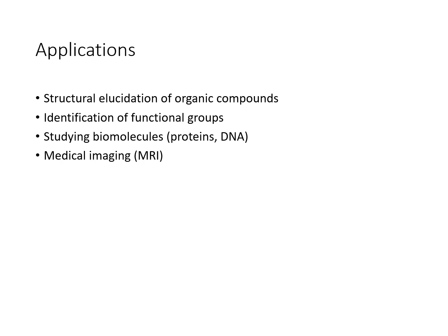NMR is essential for determining the structure of organic molecules. It is used to identify functional groups, study proteins and DNA, analyze reaction mechanisms, and even monitor purity. In medicine, the same principles are used in MRI scanners to image the human body.